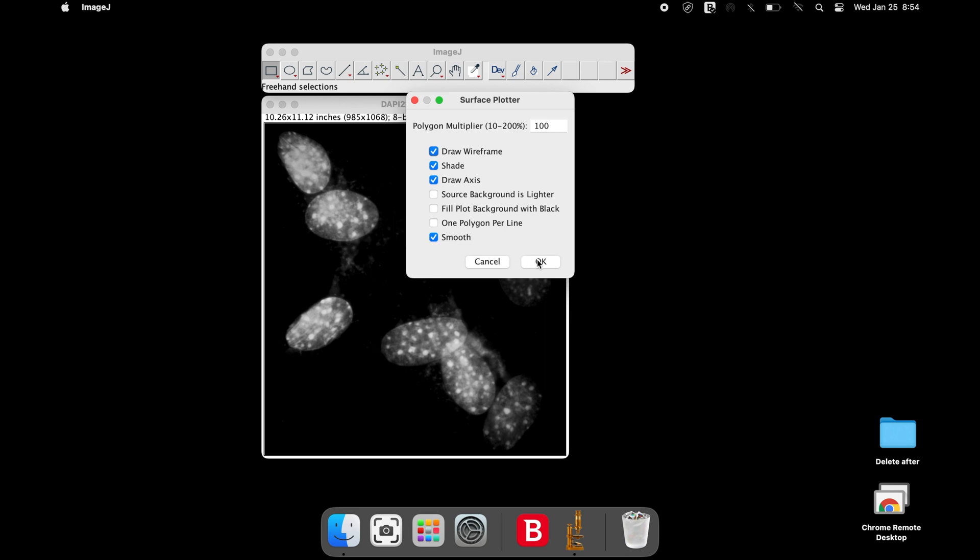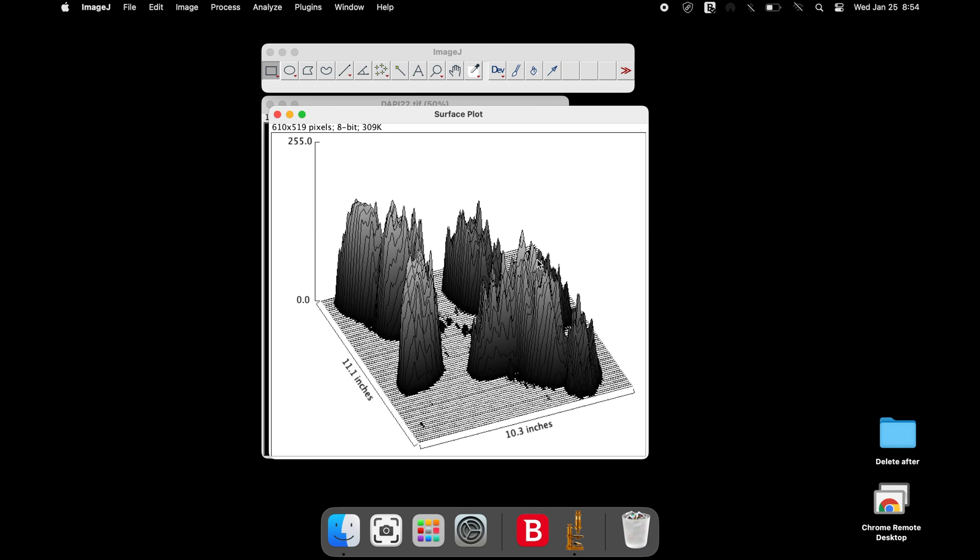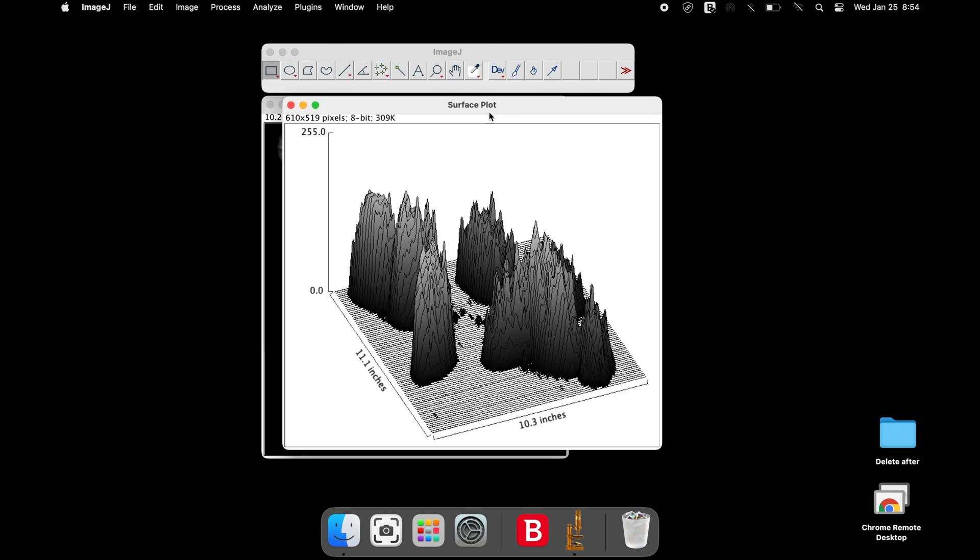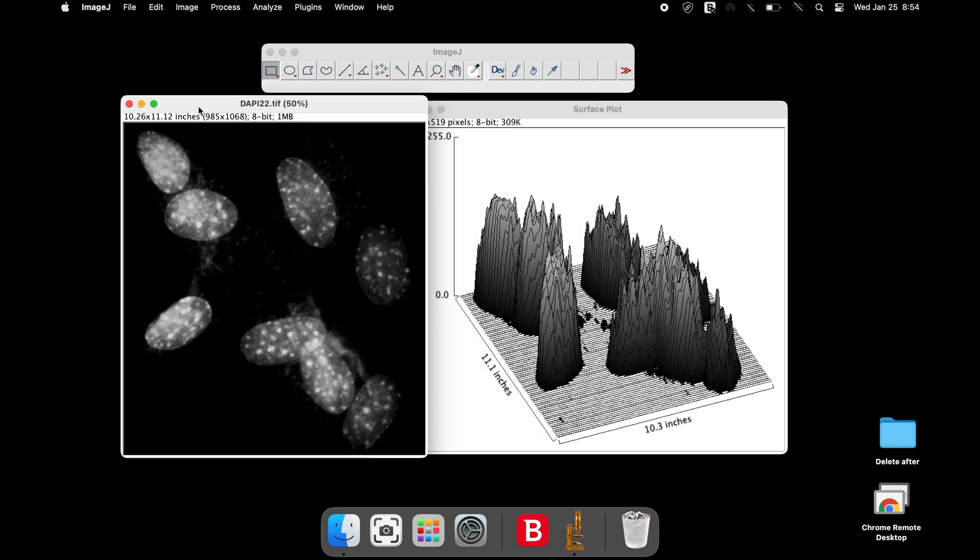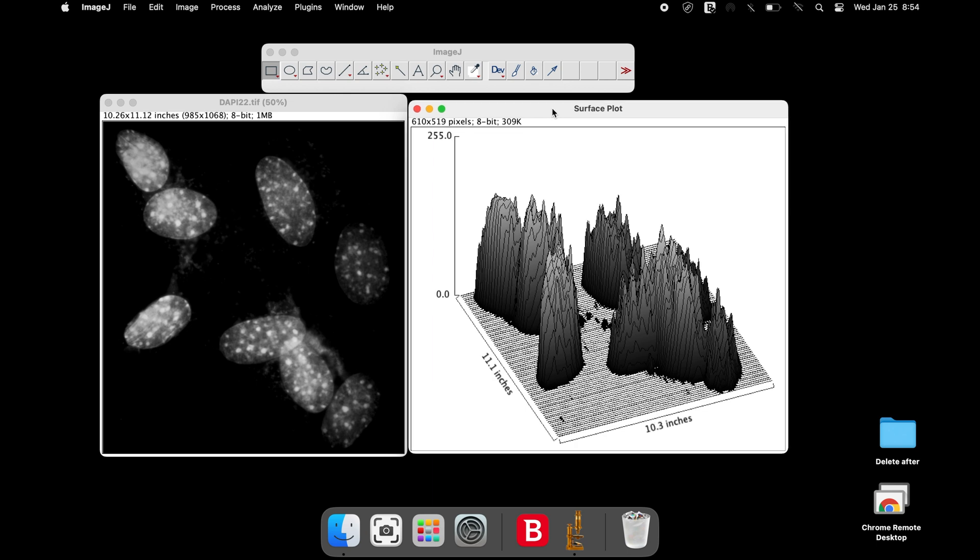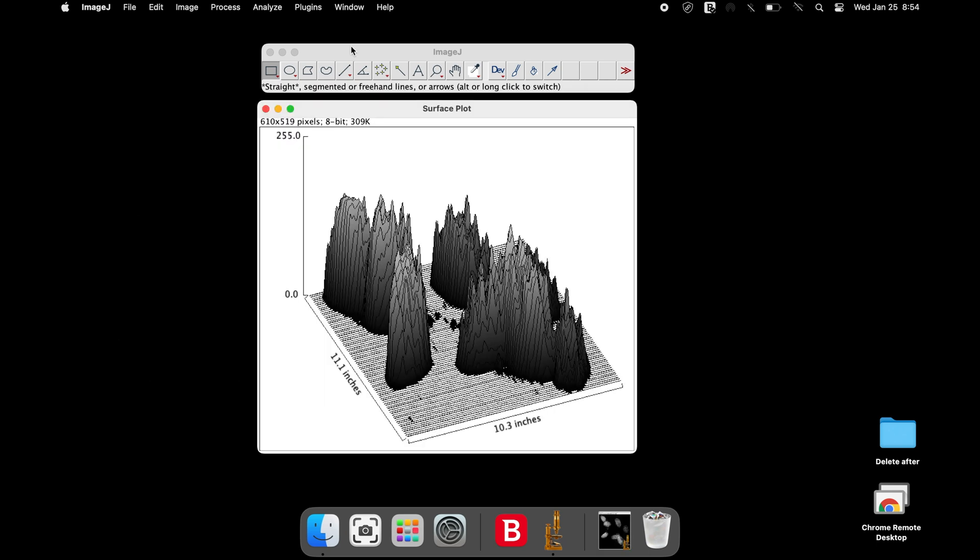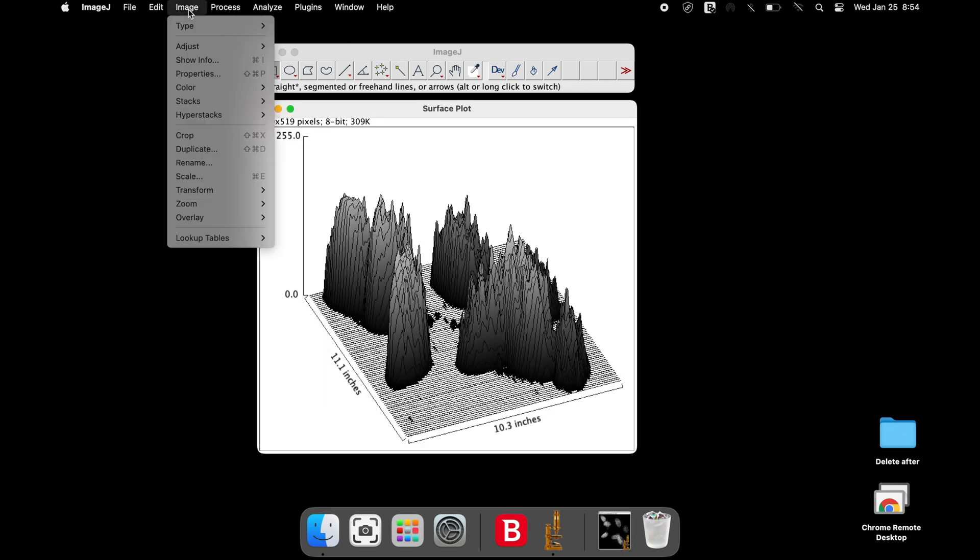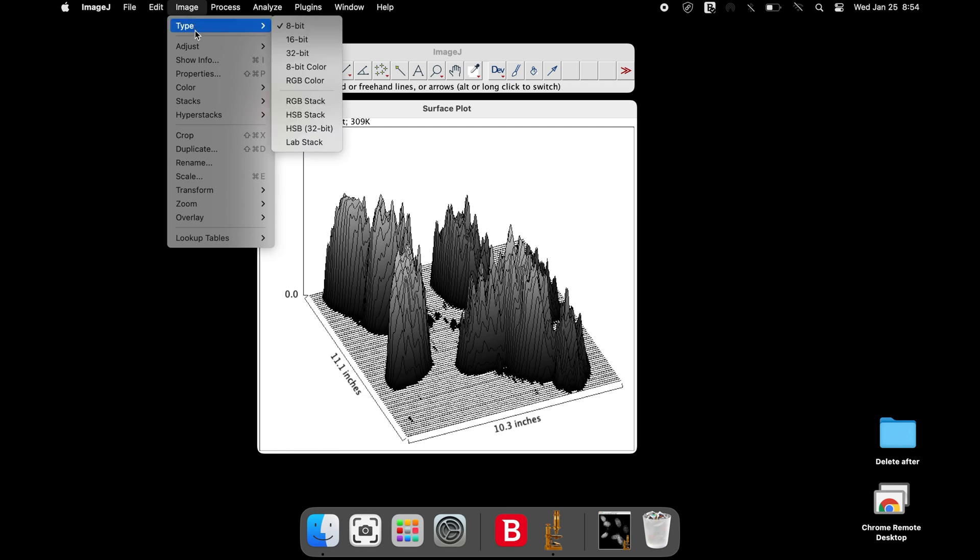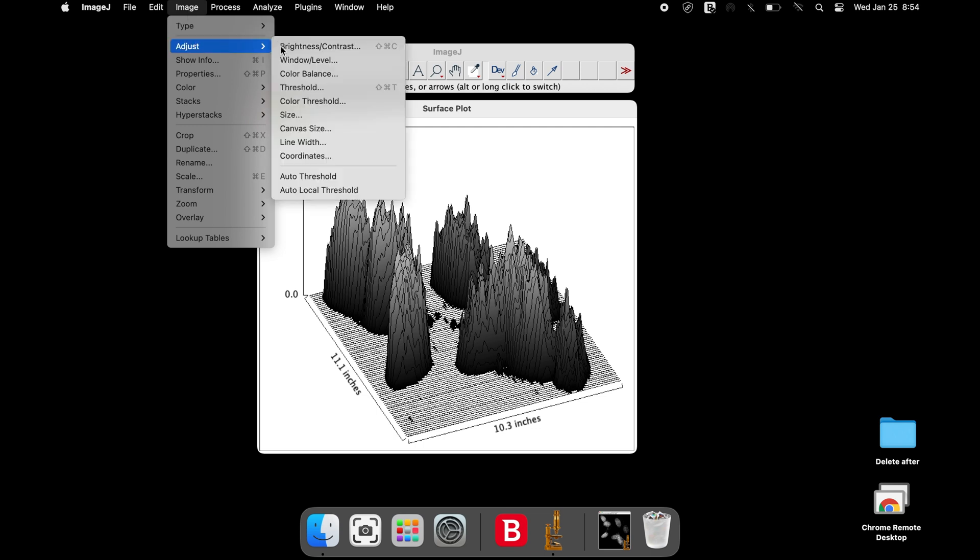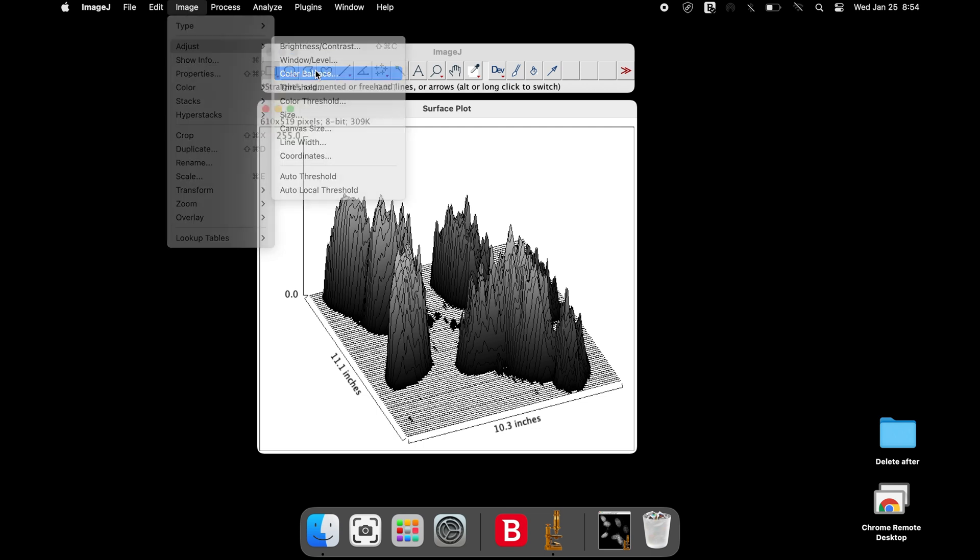Now, the 2D image has been converted into a surface plot. Color modification can be applied by selecting the image, adjust and color balance.